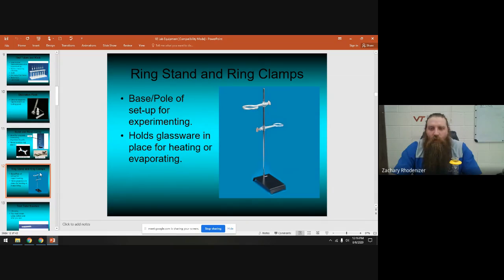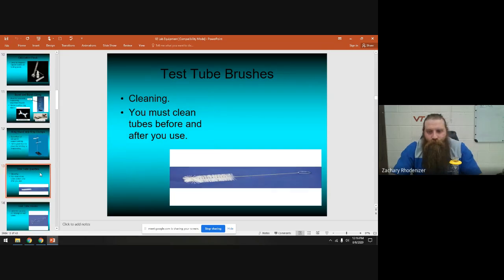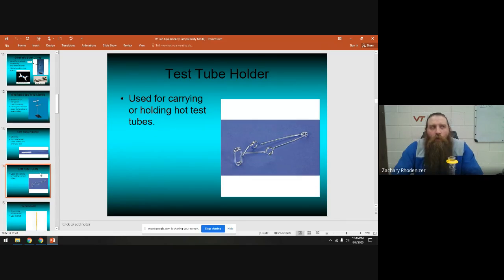The ring stand is what we attach clamps to in order to set up experiments. It holds pieces of glassware in place for heating, evaporating, or distilling — pretty much every experiment starts with setting up a ring stand with a ring. When cleaning your test tubes, use test tube brushes, which come in all different shapes and sizes. Don't force them. You also use test tube brushes to clean graduated cylinders, and there are long burette brushes for cleaning burettes.